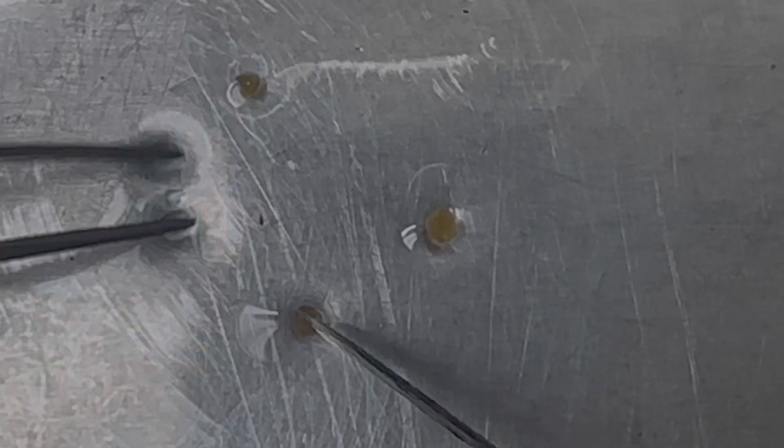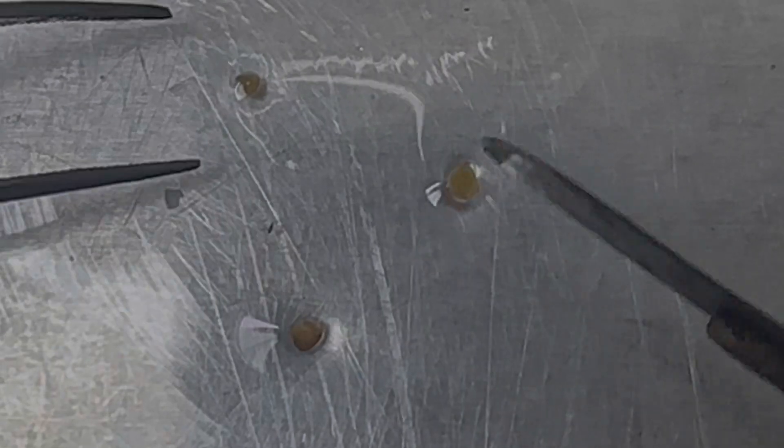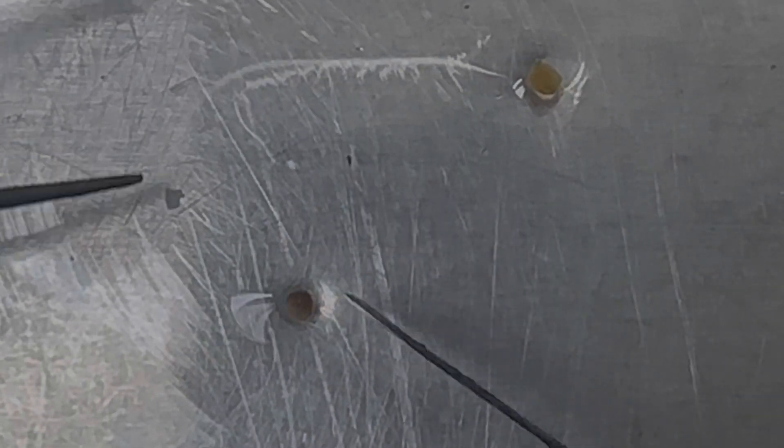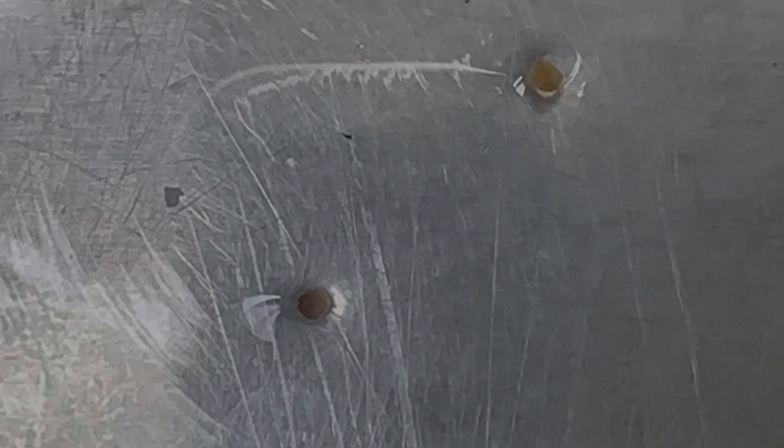I'm just peeling this off, trying to remove those leaf primordia. And this is what I'm done with — this is the inside. So this should be fairly clean to the point that I should be able to get regenerated plants just from this tip right here.